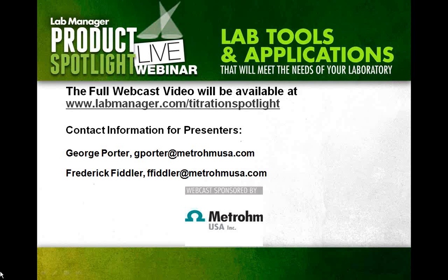So to properly investigate this, one of the key things to do would be to clean that entire cell and start with fresh methanol, if we're talking about a general KF volumetric. Perform your conditioning, perform your factor method, perform your titration of your standard, and that should have no carryover because we're talking about a water standard that is in solution.